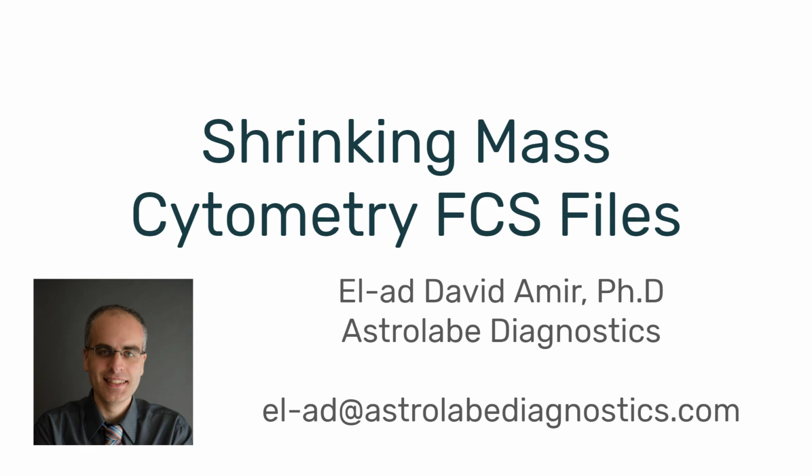There has been a thread on the Cyto forum where one of the researchers was talking about how he manipulated a CyTOF FCS file. I think it was with an R script, and the size of the file shrank by quite a bit, actually. And this is a known issue, and yet it can be quite alarming, especially for someone who is new to the CyTOF, or let's say an immunologist who doesn't usually use bioinformatics tools and is now using R to edit one of your files and sees that the file size shrinks.